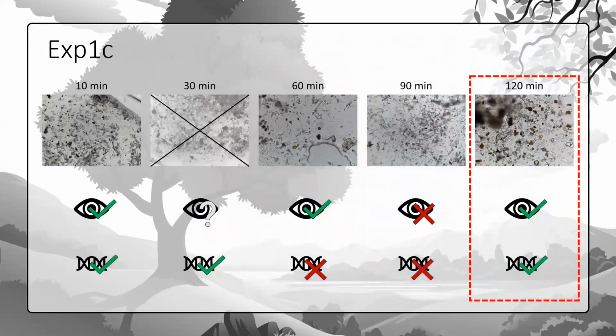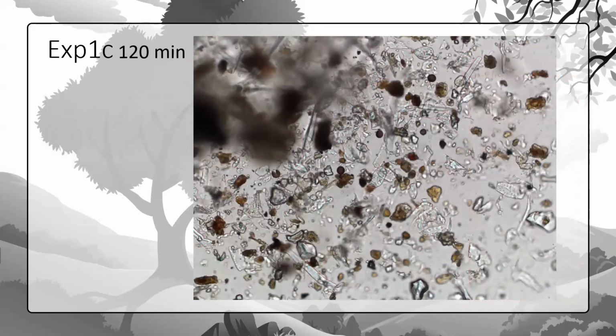And now just look at the huge mess that we can create. This is basically this one. What you can see right now is a huge amount of resin particles that learned to fly, a huge amount of insect cuticula. There are even some legs there. If you go further up here, there is an entire head of some wasp. Then here is the beginning of a clump of filter fibers.